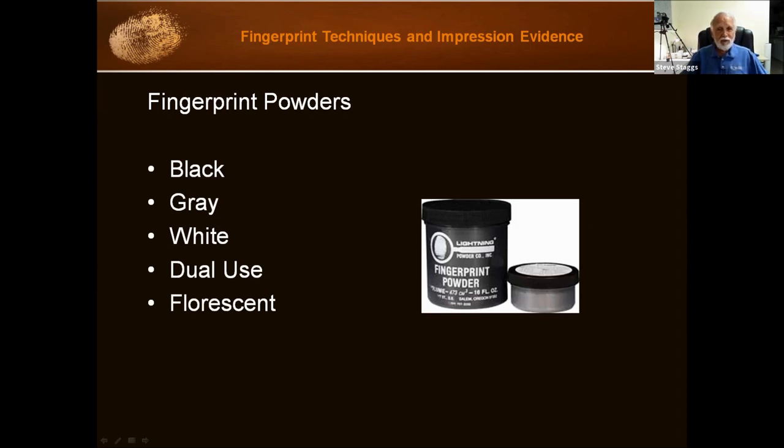I just use black powder. The reason why is I can take my flashlight, hold it at an oblique angle on a black surface, and dust with black powder and see the prints come up. It takes a little practice and getting the right amount of powder may be a little more tricky, but I find it works well for me.